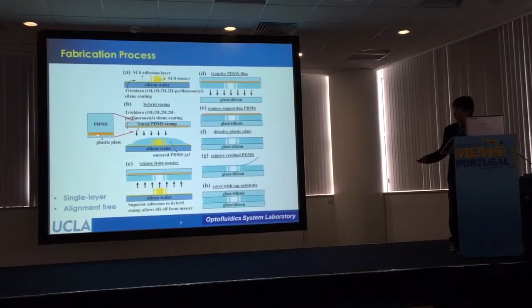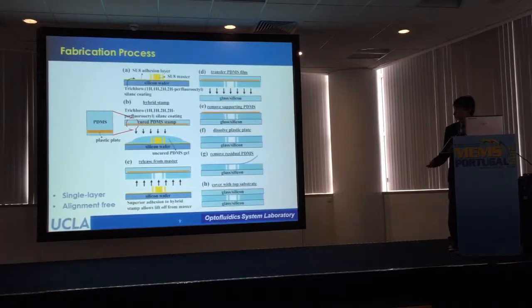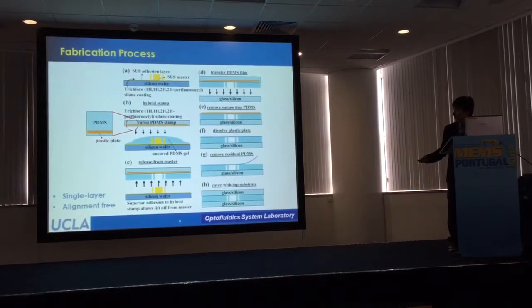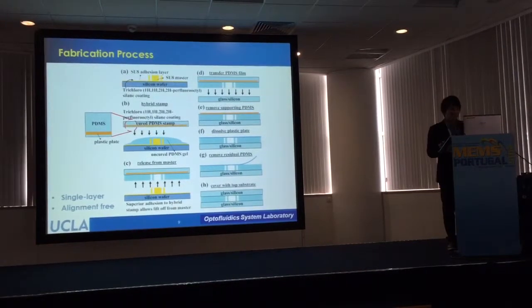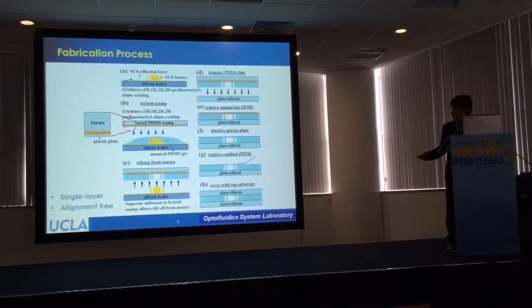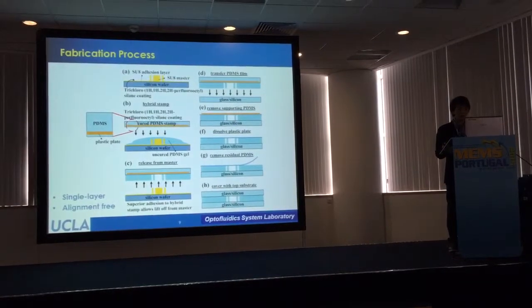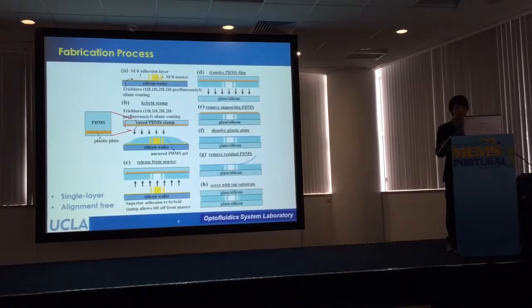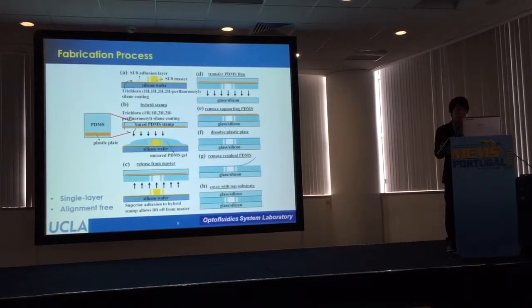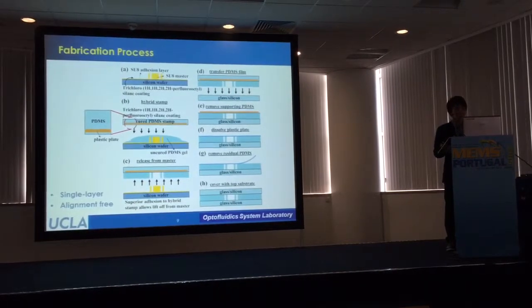We have a plastic sheet embedded at the bottom surface, but we still have a very thin layer of PDMS thin film beneath the plastic sheet. So this is the key of this fabrication. And we pour uncured PDMS on the mold and press each other with sufficient pressure that can repel uncured PDMS on top of the mold structure, but still remain the contact surface to be flat.